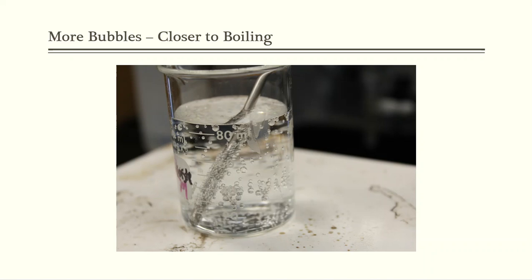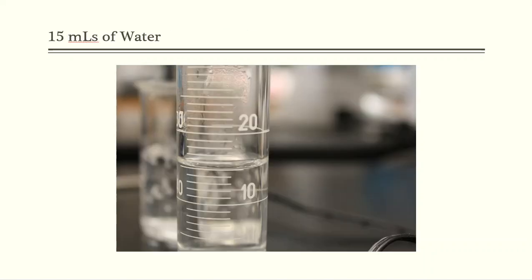Due to the calculations in the beginning of the lab, we have an estimate of how much hot water this is going to take. And again, it's going to be anywhere between 14 to 20 milliliters, depending on how much you weigh out. And all of that is dependent on your start weight. So my target here was around 15, give or take a little bit.